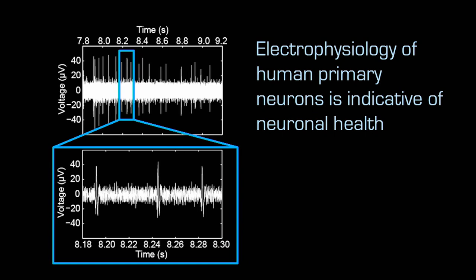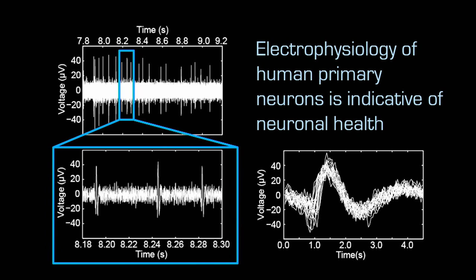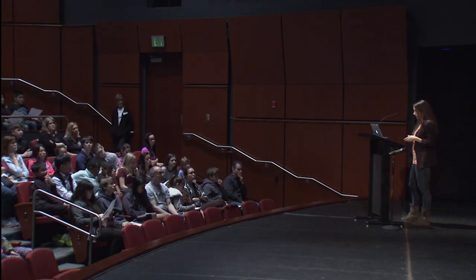If you zoom in on a couple of those spikes, you can start seeing that they have a distinct shape. If you zoom in a little further, there you see that classic action potential or response, right? You have the rise and the fall and the peak. We can look at human cells with this, as Chris mentioned, which is really important, because then we can tell how you're going to respond to something. We can characterize your cells and look at responses to different treatments.